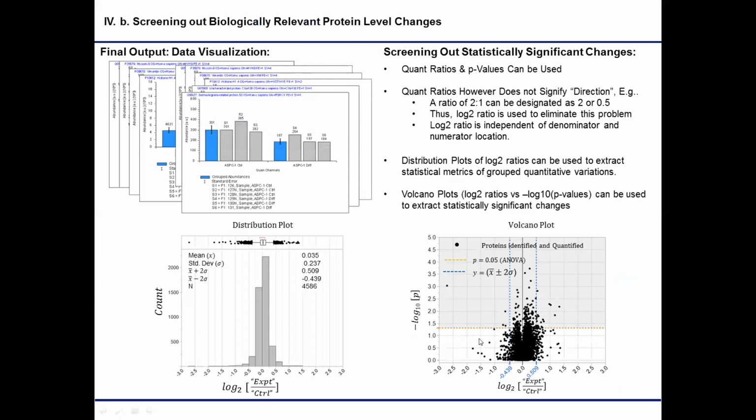So I want to highlight here, the really small numbers will be the bigger numbers after you do the negative log 10 transformation.